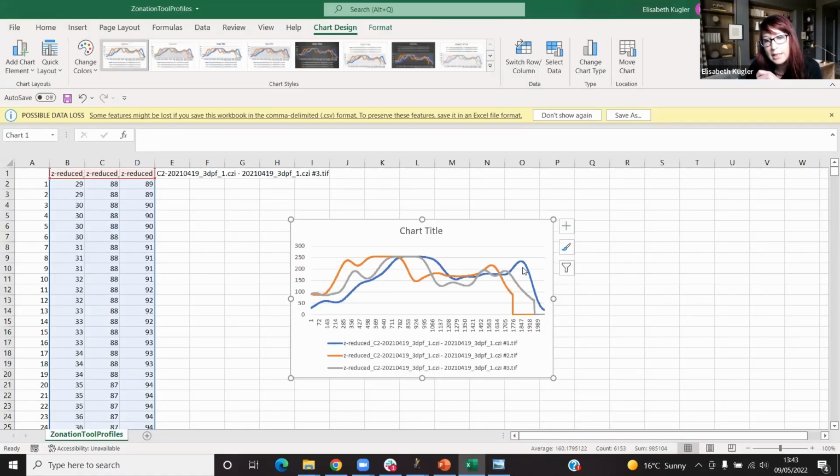And also what you see is that these two have a different size, and that's why the end feet are at a different position and the image ends at a different position. And if you would have selected your normalization before, they would have just been stretched to the same size. But in this case, it shows us truly that these are slightly different in height, these two images.